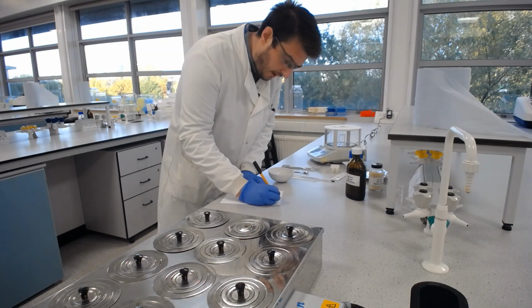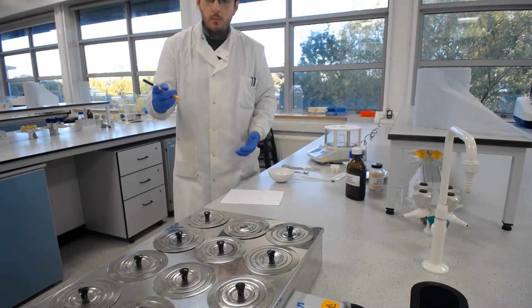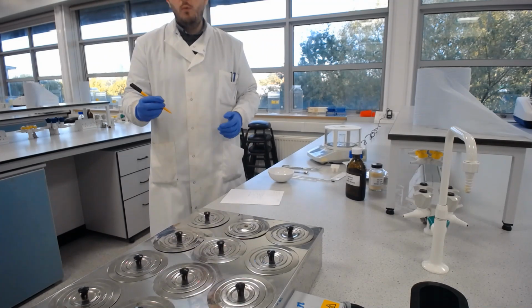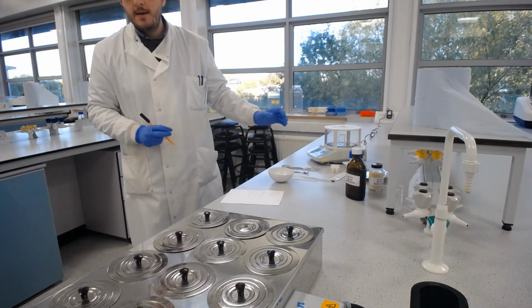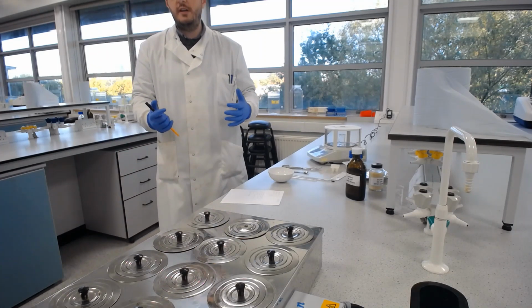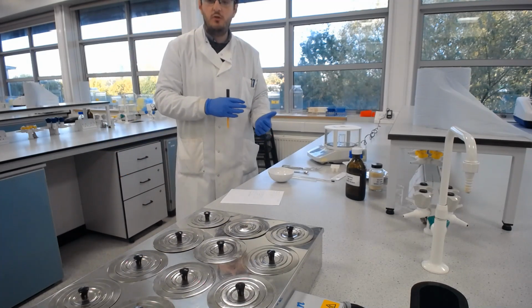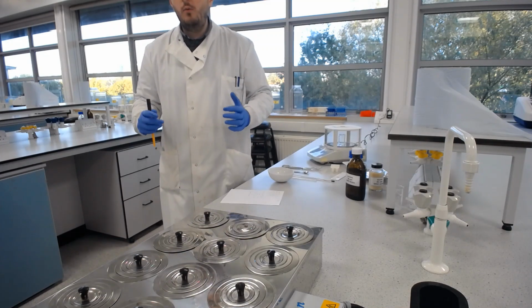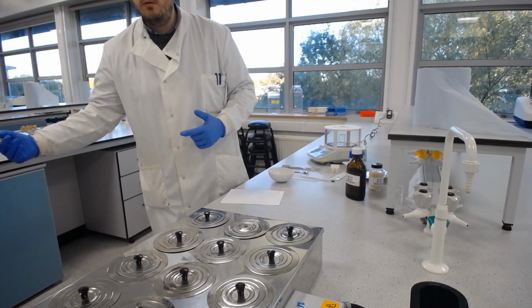So I'm going to make a note of that, because I won't remember that, and I'll need to come back to that later. What I'm also going to do at this stage is add up what the total mass would be with the water and the gelatin in there. Because later on we're going to have the water and the gelatin there, but we're going to have an excess of water, and we're going to evaporate the excess of water away until we have the right amount of water in there. So I need to know what mass that's going to look like, so I don't have to be doing maths on the go later on.